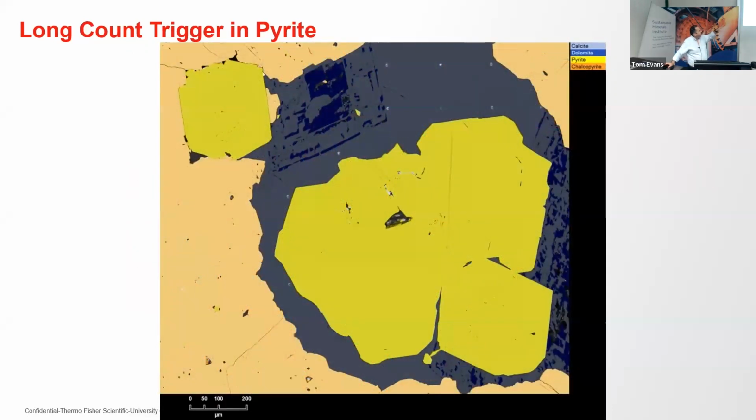So then we can zoom in on some of these areas with pyrite grains. In this case, again, we have the BSE image. We love this kind of visualization. We have the BSE image in the background overlaid with our minerals: chalcopyrite, pyrite, and carbonates. And everything is still classified as pyrite, especially because the cobalt in this case happens as an impurity, with the highest concentration probably around 2%. So the spectrum is still very similar to the pure pyrite spectrum.